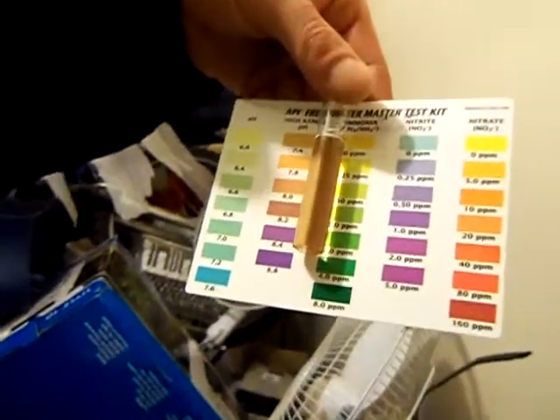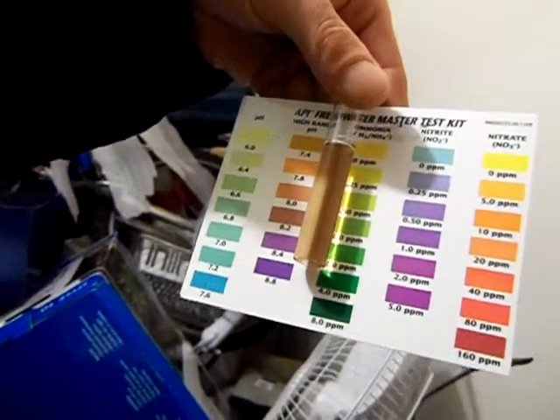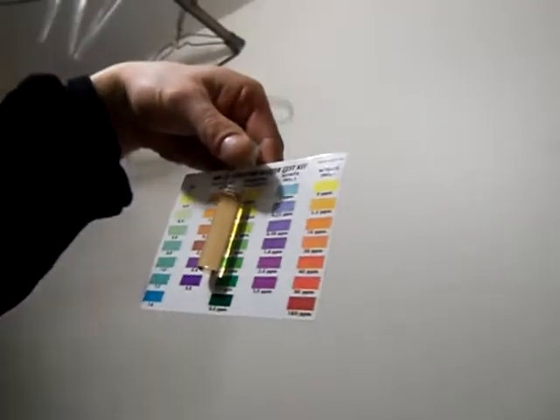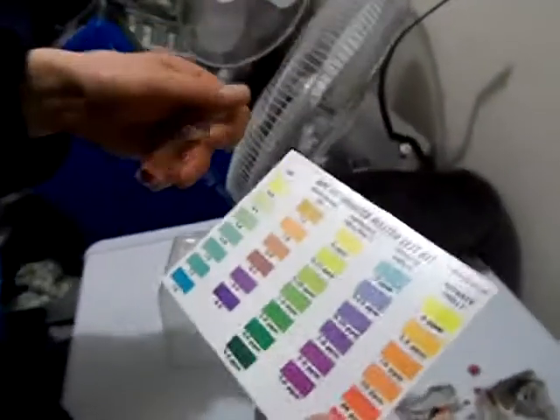Sophia said 7.4 — yeah, 7.4. I'm just trying to get some more light shining on it here. I'd say 7.4 after a 24-hour period.